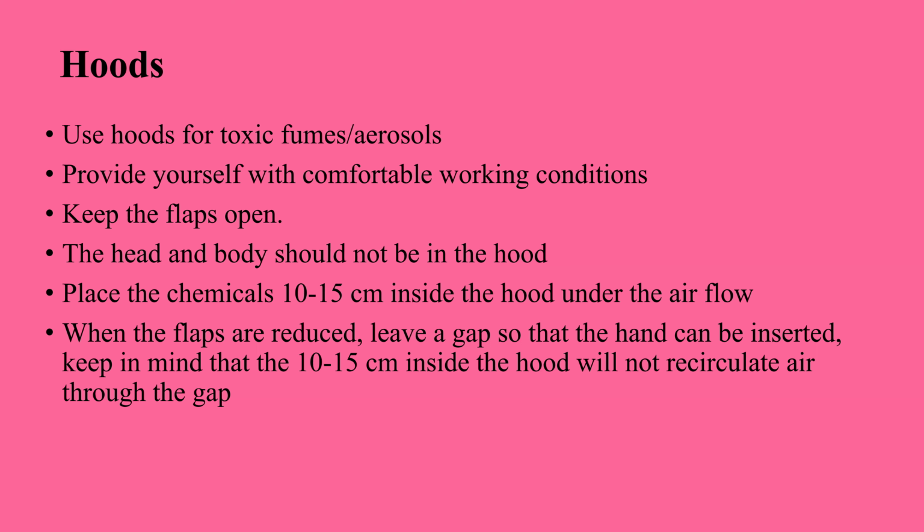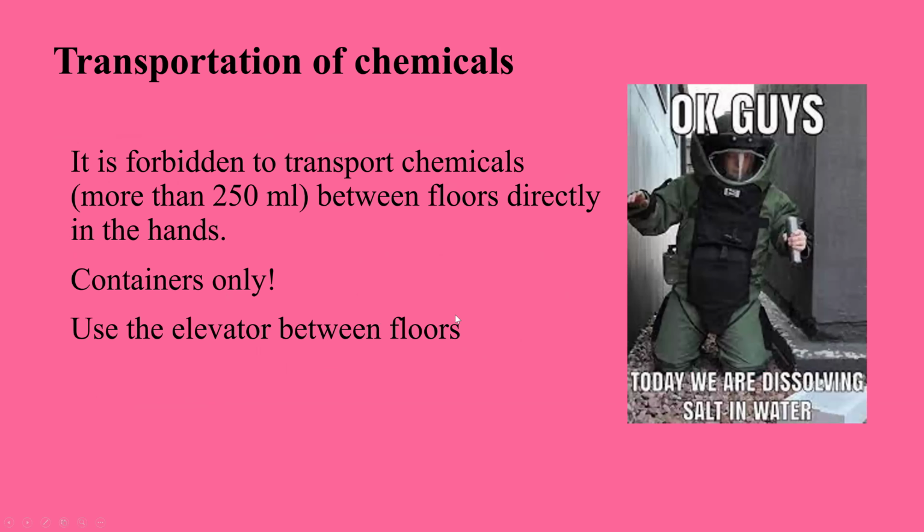If you have a hood, you should move only your hands inside. If you have some chemicals, you move more than 10 centimeters inside, under the airflow, because it's protection from respiratory tract injury.